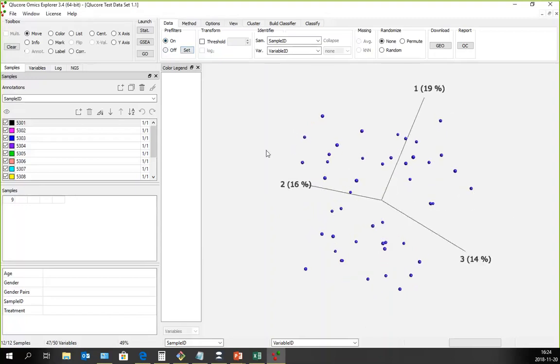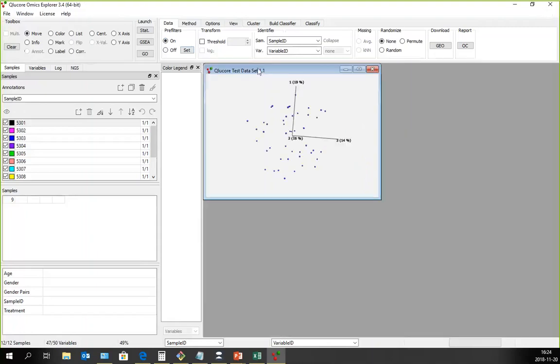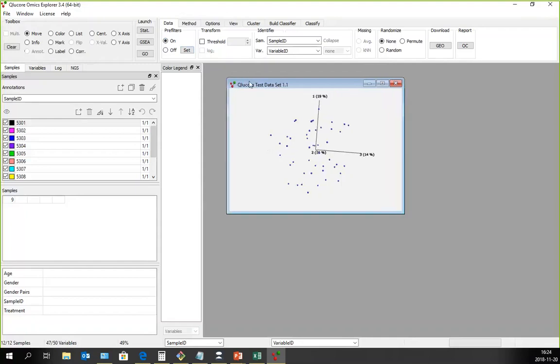Really useful for data analysis where you know that, for example, certain arrays or sequencing machines will output a certain value for an error. For example, will output 9999 where there is no available data. And you know that, so you can just say that, okay, any value above 9998, throw that away. So you get your bad values sorted out from your data. Useful, and useful especially where you have large sets of data where you inevitably get these measurement errors from your machines. That was the second feature for today, and today's third feature is the annotation wizard.